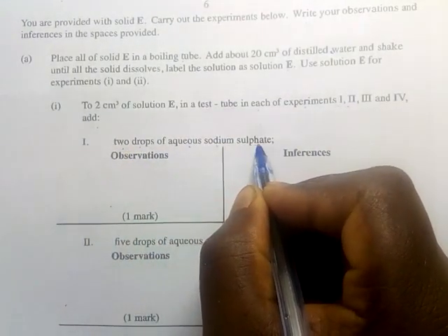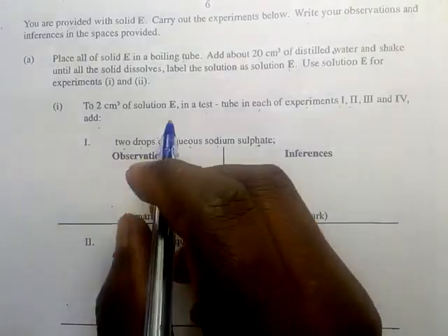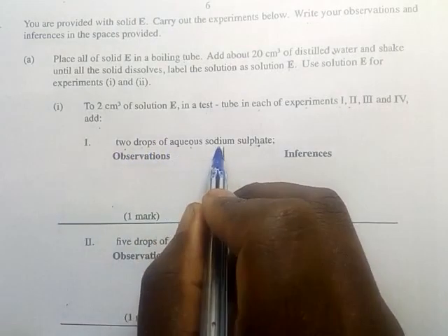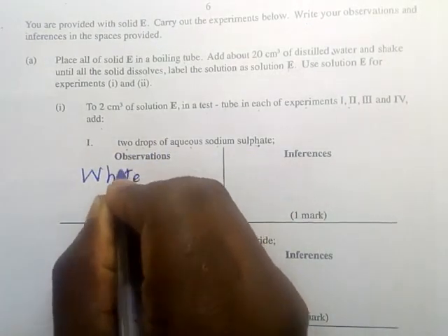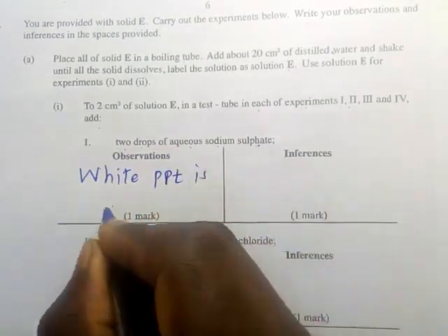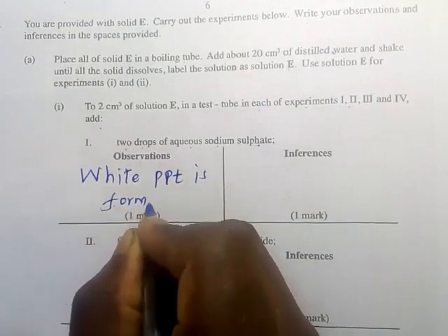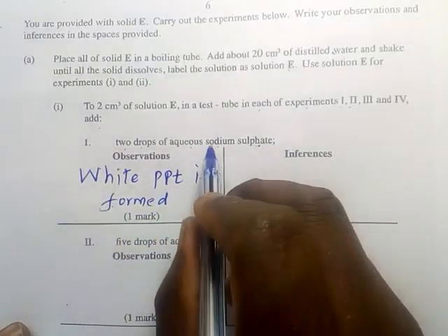So we are adding aqueous sodium sulfate. Therefore, our observation is that a white precipitate is formed. A white PPT is formed. We are adding sodium sulfate.